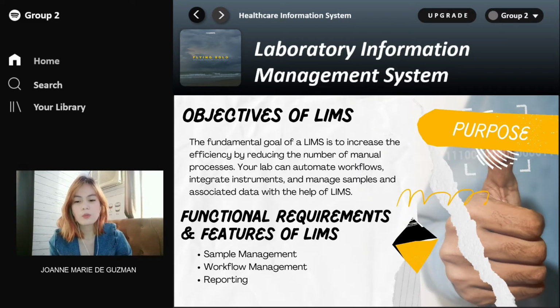Objectives of LIMS. The fundamental goal of a LIMS is to increase efficiency by reducing the number of manual processes. Your lab can automate workflows, integrate instruments, and manage samples and associated data with the help of LIMS. So, all relevant functions, such as automatic data capture, data entry into the system, and data storage, are the responsibility of the LIMS service provider. Some LIMS are more suited to specific lab types than others, and they may not be suitable for all labs. So what are the functional requirements and features of LIMS?